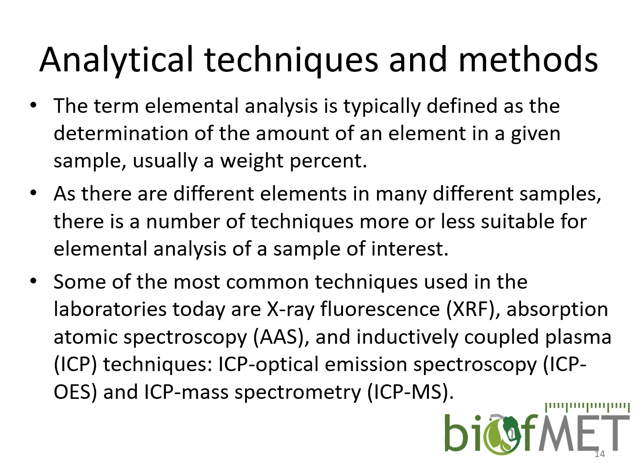So all these three aspects need to be taken into account when choosing the right and appropriate analytical method for the analysis. So you need to know what the matrix is, what other elements you have there that could possibly be interfering with your element, what the form of the element is, whether it needs some additional preparation in order to transfer it into analytical form, some form of derivatization, and of course you need to know which concentration range you want to cover. So not all analytical techniques are capable of covering a large scale, talking about concentrations, or a large number of different analytes.